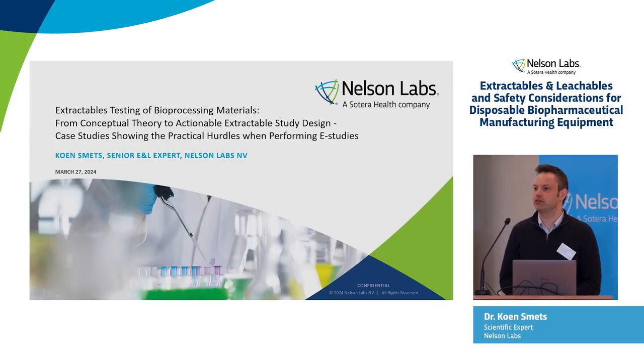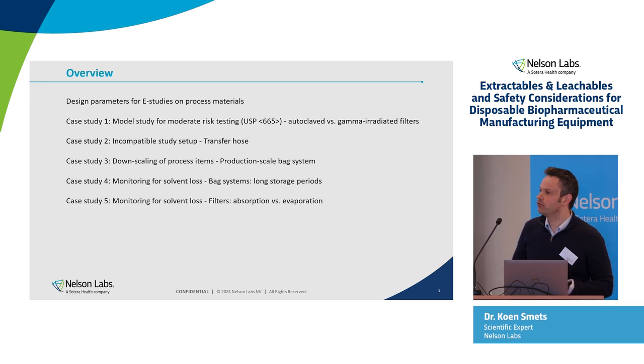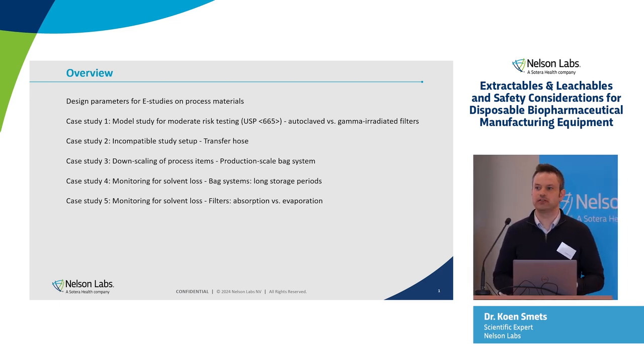My presentation will be on extractables testing of bioprocessing materials. I will give some practical examples and also some of the hurdles you might encounter when performing extraction studies on process materials. So first, an overview on the design parameters you should take into account when doing or designing extractable studies for the process materials.